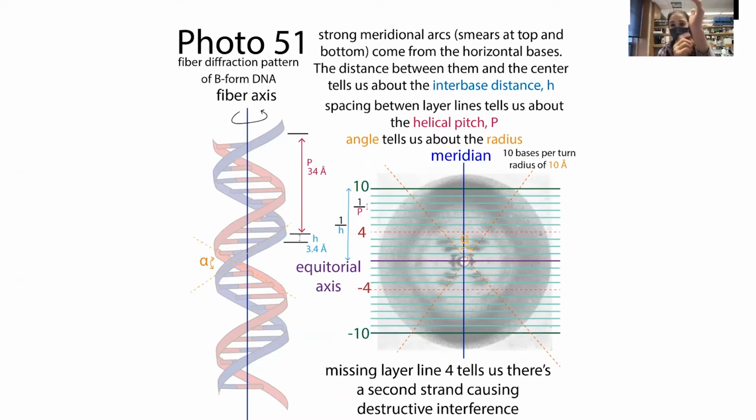even though you can move them up or down or whatever, because they're all along the same axis of symmetry, you can get this repeating spacing of the units that then give you information. It's not quite as much information as you would get from crystallography, but you can still get information about the geometry, because it's the inherent geometry of these molecules that is giving them this regular spacing that is going to allow them to produce those diffraction signals, the diffraction pattern.